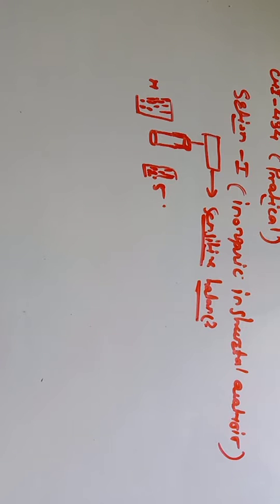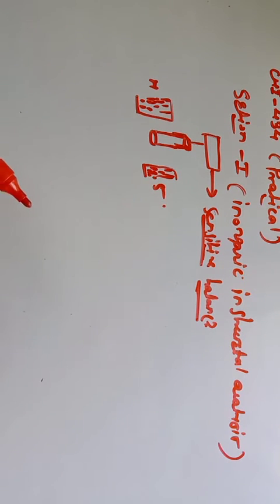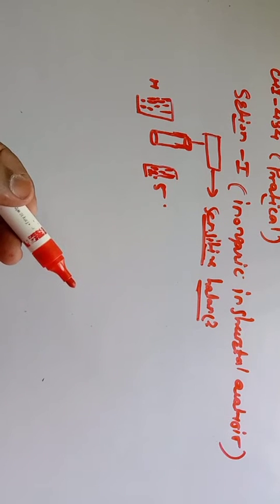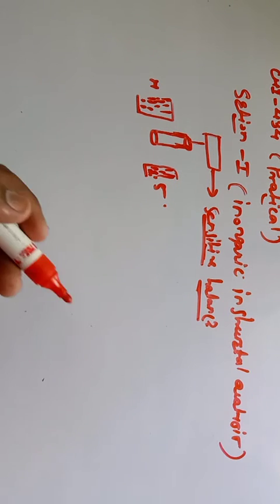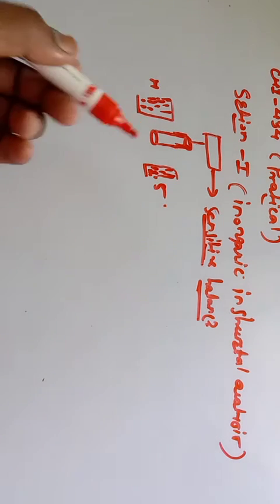The balance is very simple, though it is not the balance which is used in the laboratory. It is the balance which is used when we take vegetables, in Marathi it is called tarazu. So it is very simple, just like a tarazu. It is your sensitive balance. One side it is filled with loads, means certain weights we can consider. So one side of the balance is filled with weights, and the other side is connected to this cylindrical tube.